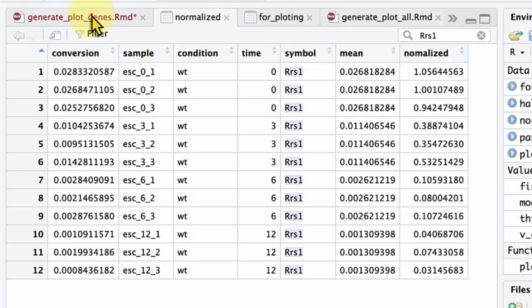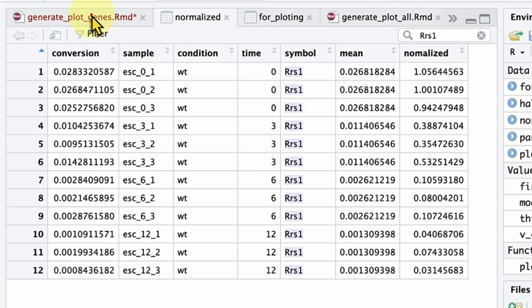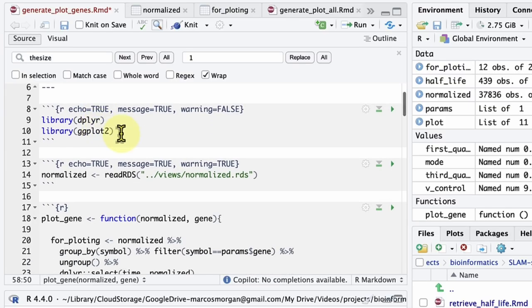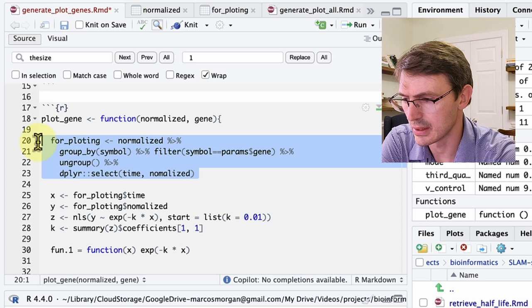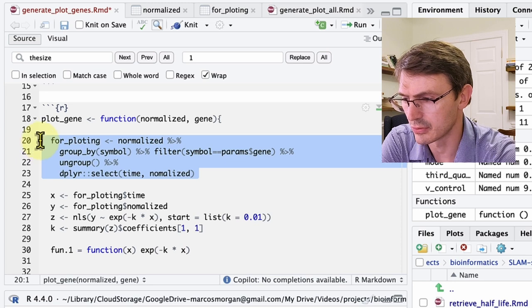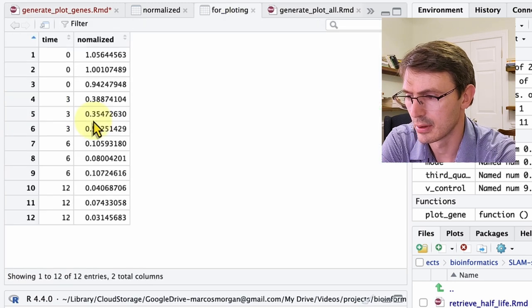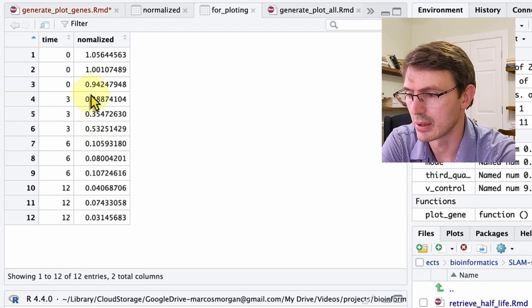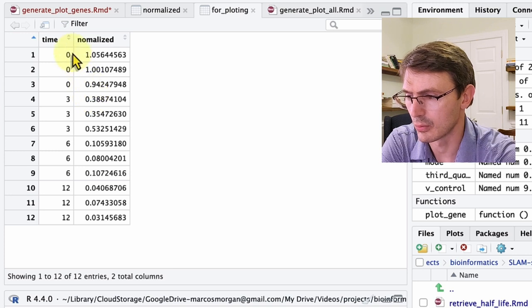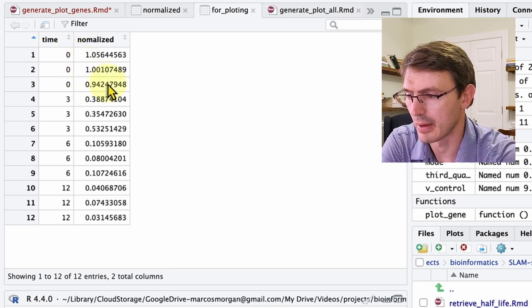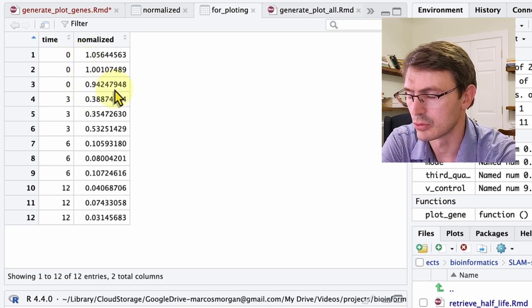Now let's plot the data for this gene in a nice graph that we can use for a publication. The first thing that we are going to do is get the conversion or mutation values from the normalized table for our gene of interest. So we have this normalized table that I show you how to generate in my previous video, and you can check now using the link on the screen. We are going to get these values for our gene of interest for plotting. And this is for the Rrs1 transcript where we see the decay with a half life of around two hours.